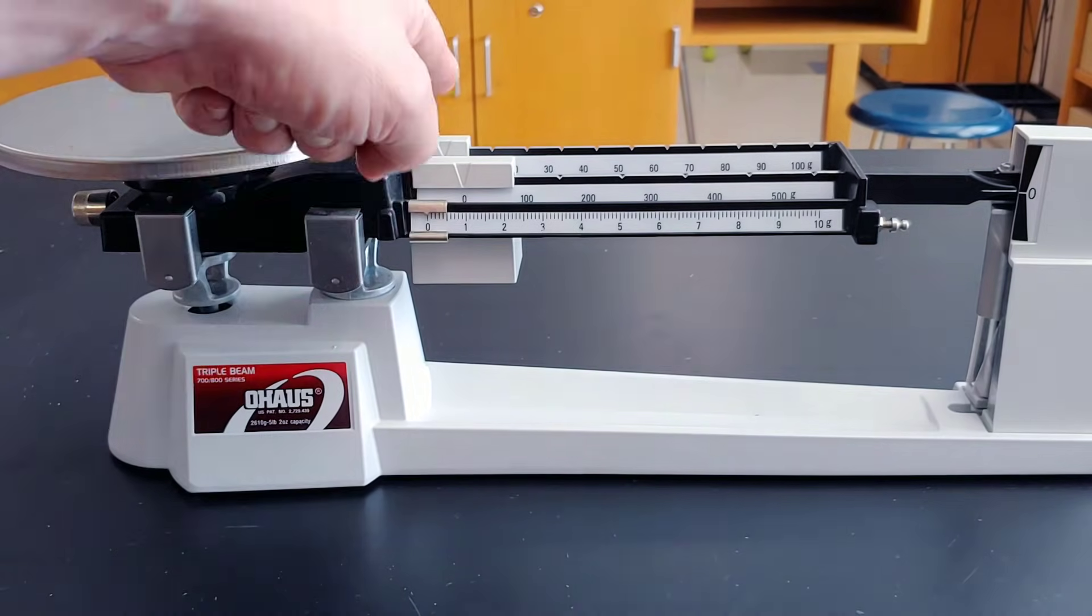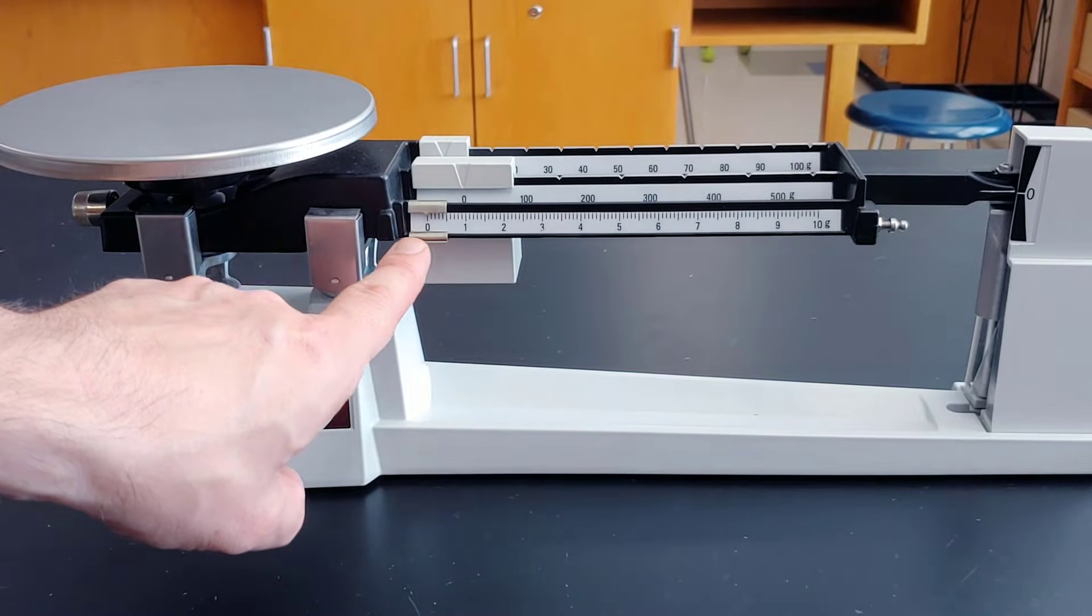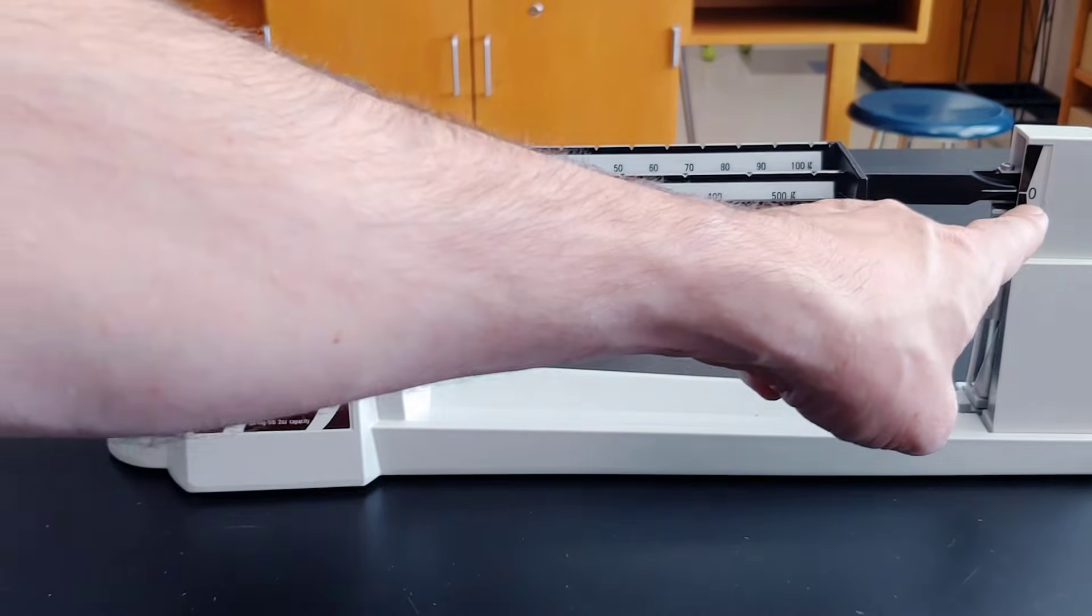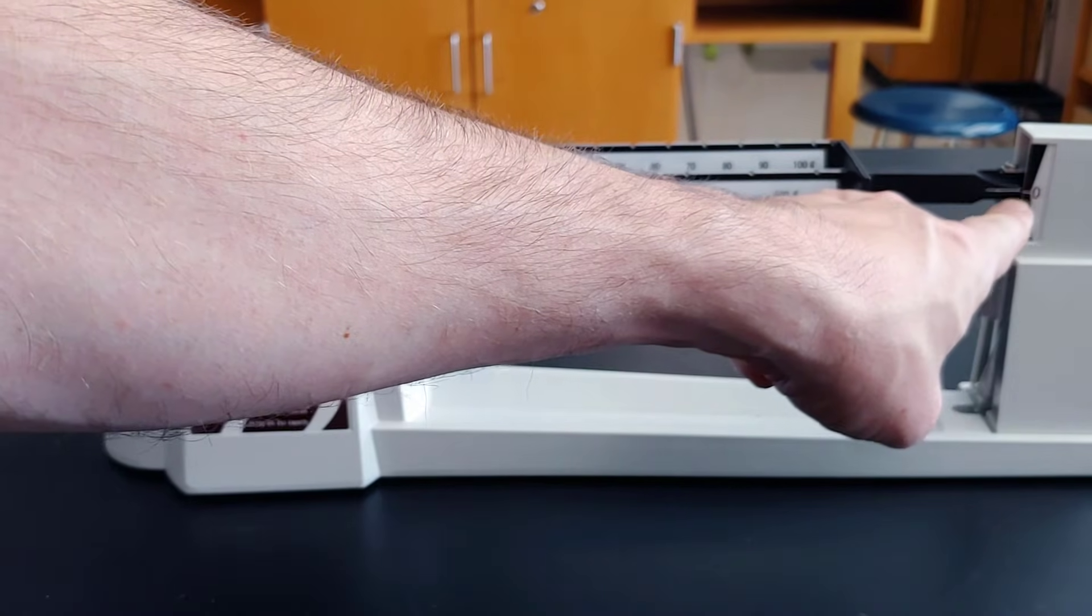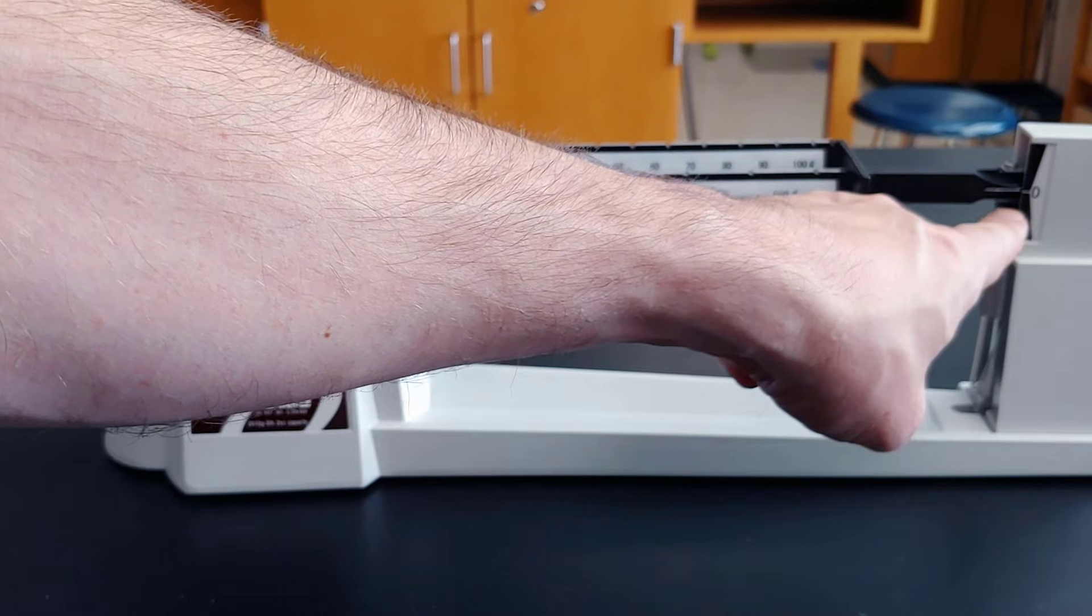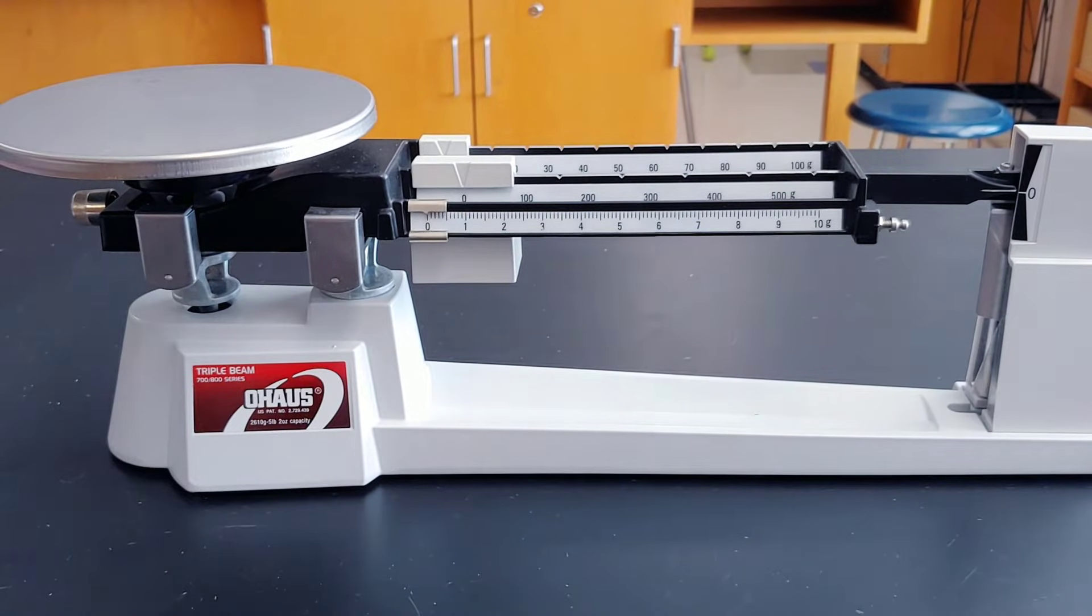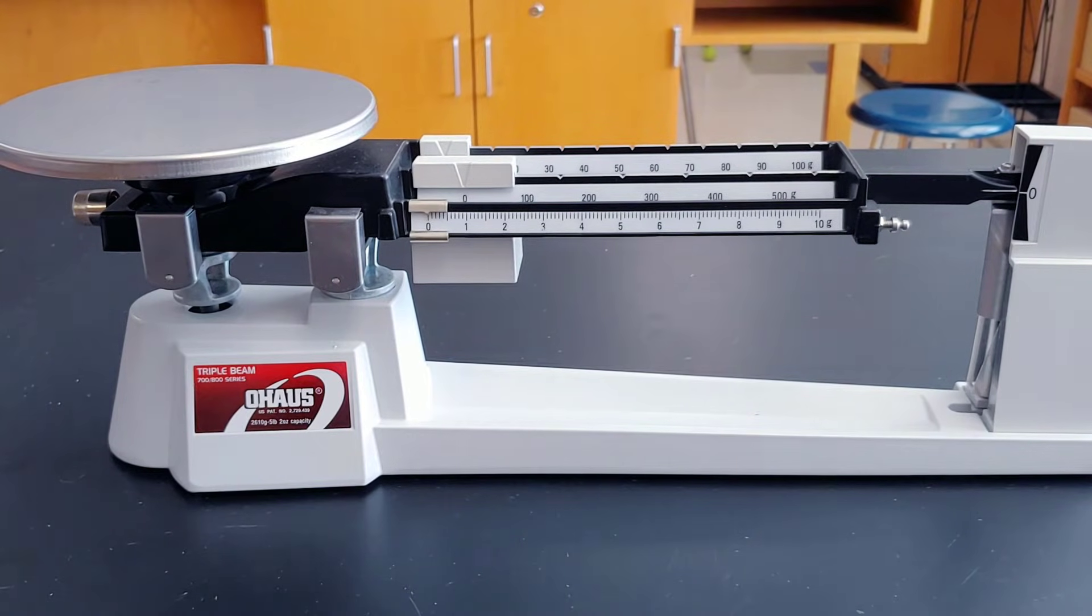All these should start off on the zero. This is called having it zeroed. And the line should also be on the zero. They should be matched up. If not, you may need to recalibrate your triple beam balance.